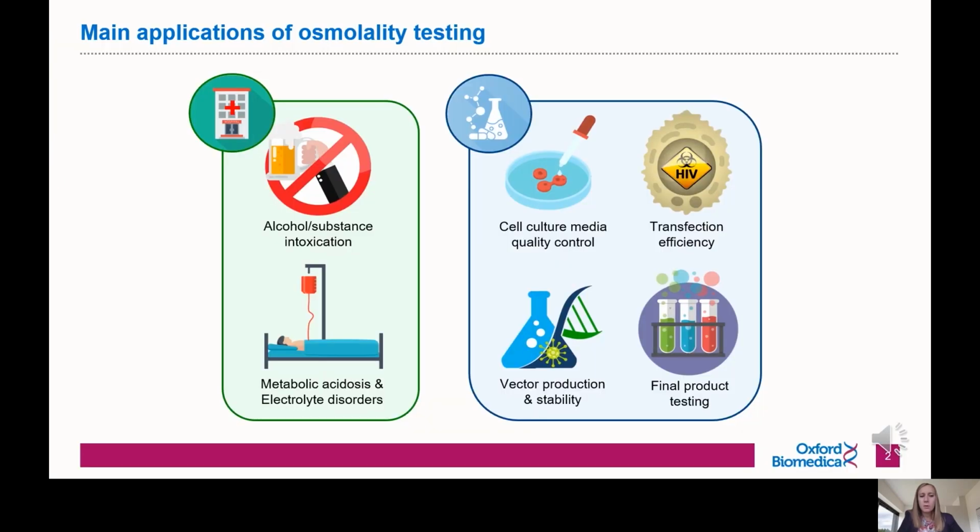I'm sure you're all aware of what osmolality is and how it can be used in both the healthcare sector as well as the biopharmaceutical one. And of course, in particular today, I will be focusing on how we can use it at Oxford Biomedica for characterizing our lentiviral vectors, as well as improving the manufacturing process of them.